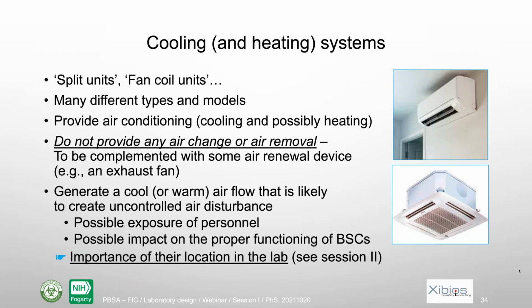Actually, this system only provides air conditioning. That means they cool, possibly heat the air, and also reduce the humidity level. But they do not provide any air change or air removal. Actually, they take the air from the lab, they cool it down, and then they blow it back into the lab. So there is no ventilation effect in the lab.